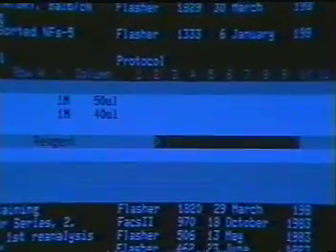Fluorochrome reagent information is entered in the same manner. First, use the flat commands to position the cursor on a white line below the appropriate fluorochrome subheading. Then press insert and answer the secretary's prompts. The secretary will ask for a reagent name, the amount of protein in micrograms, and the dilution volume in microliters.